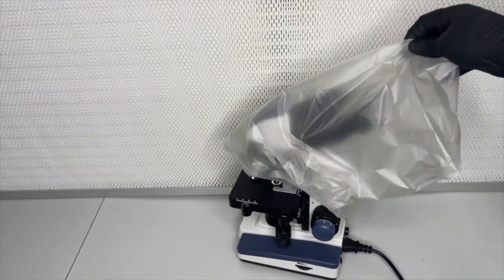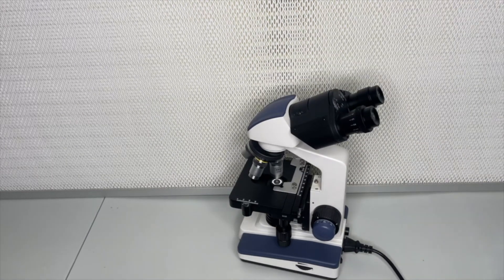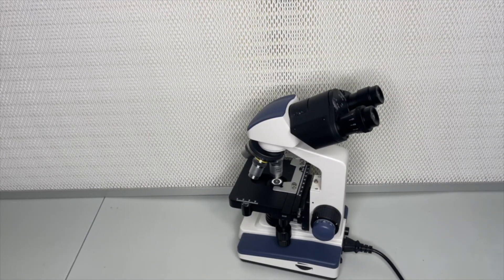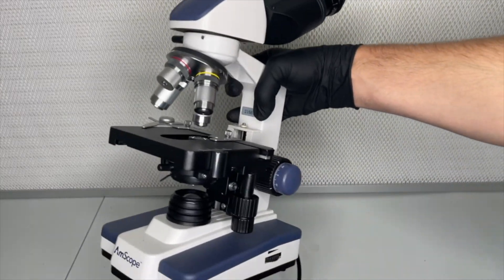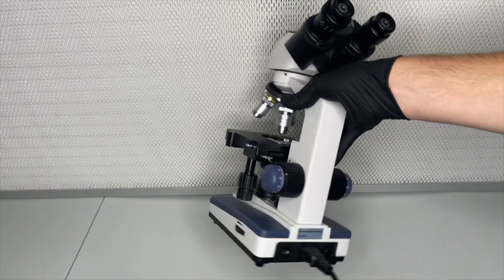This is the microscope that I use to view spores and mycelium up close. The brand is AmScope and it is pretty quality and I bought it on Amazon.